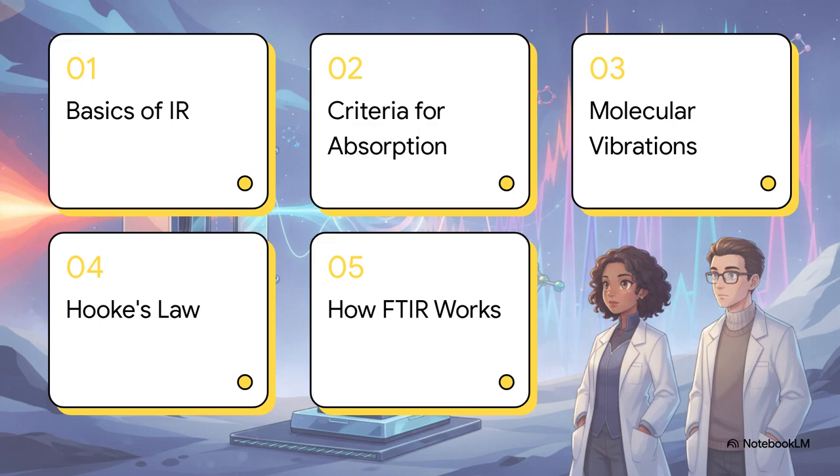Here's our roadmap for today. We'll start with the basics of IR spectroscopy, cover the criteria for IR absorption, look at the types of molecular vibrations, dive into Hooke's law and frequency, and finally wrap up with how FTIR instruments actually work. Let's get right to it.